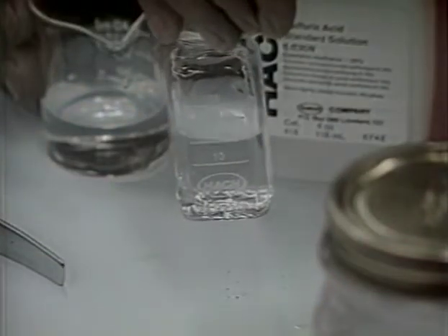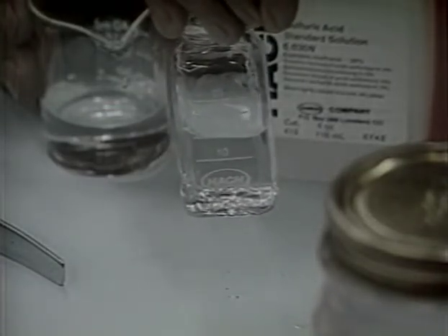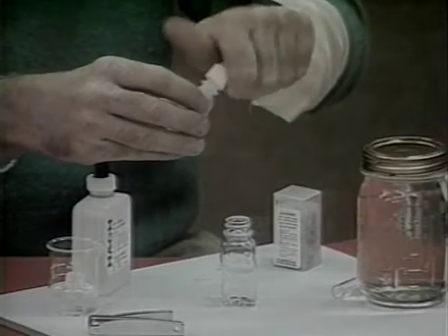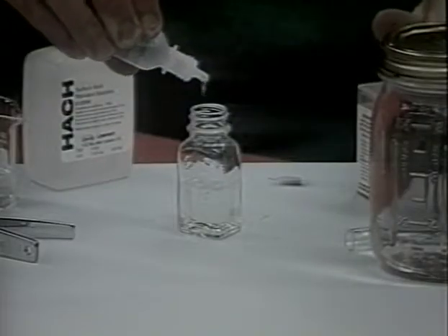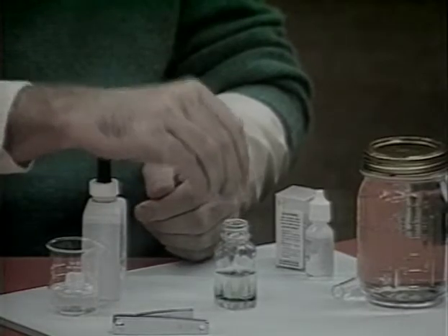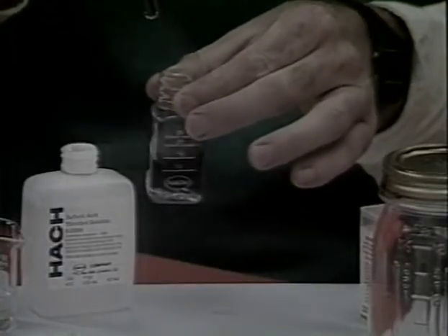To measure the total alkalinity using the low-range test, proceed as follows. First, fill the mixing bottle to the 15 milliliter mark. Proceed as in the high-range test. Add phenolphthalein indicator solution and sulfuric acid solution if necessary. Then add a bromocresol green methyl red powder pillow and then sulfuric acid until the endpoint or color change is reached.